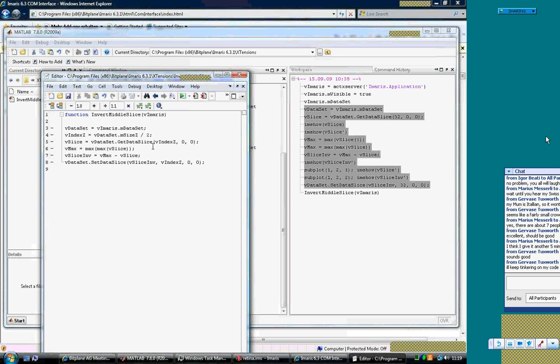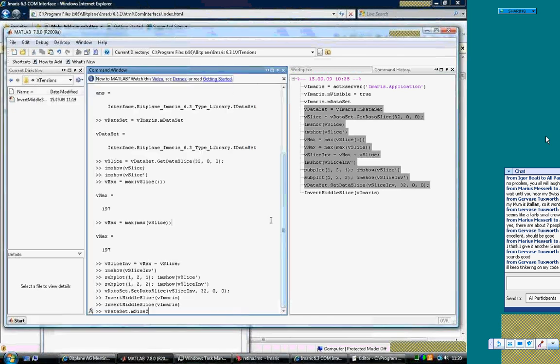So this is a variable of type integer, so even if it's an odd number, dividing it by 2, it will be automatically rounded. And MATLAB, by default, rounds by excess. So if you have 9 slices, you will get 5, and not 4 or 4.5. So now try to use it again.